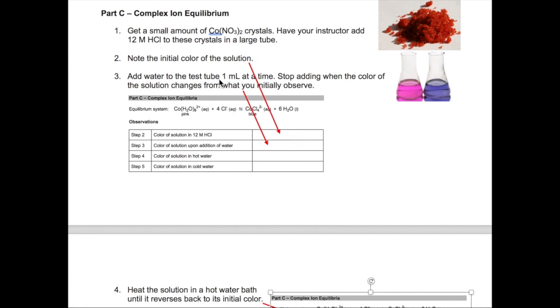Now, you will test the effect of volume change. The way you do this is by adding water to the test tube one milliliter at a time. After each milliliter of water, mix with a stirring rod and note the color. When the color changes significantly, stop the addition of water and record the color right here.